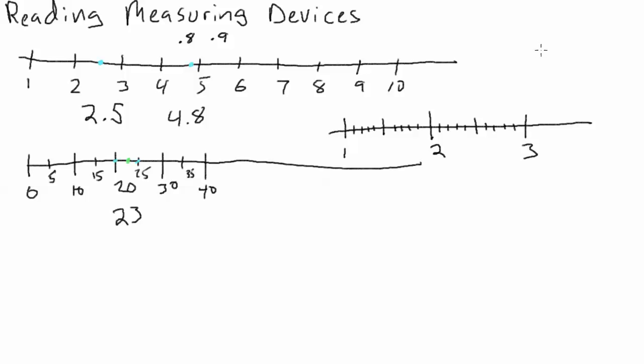And a tenth, I'm sure you all know this, a tenth is 0.1. That's 1/10. So these little marks on here are all 1/10. So this would be 0.1 right here. This would be 0.2, 0.3, 0.4, and this slightly larger mark, it's slightly larger because that's 0.5. It's halfway between those two, just like halfway was 0.5 up here. But on here, it's actually marked out.